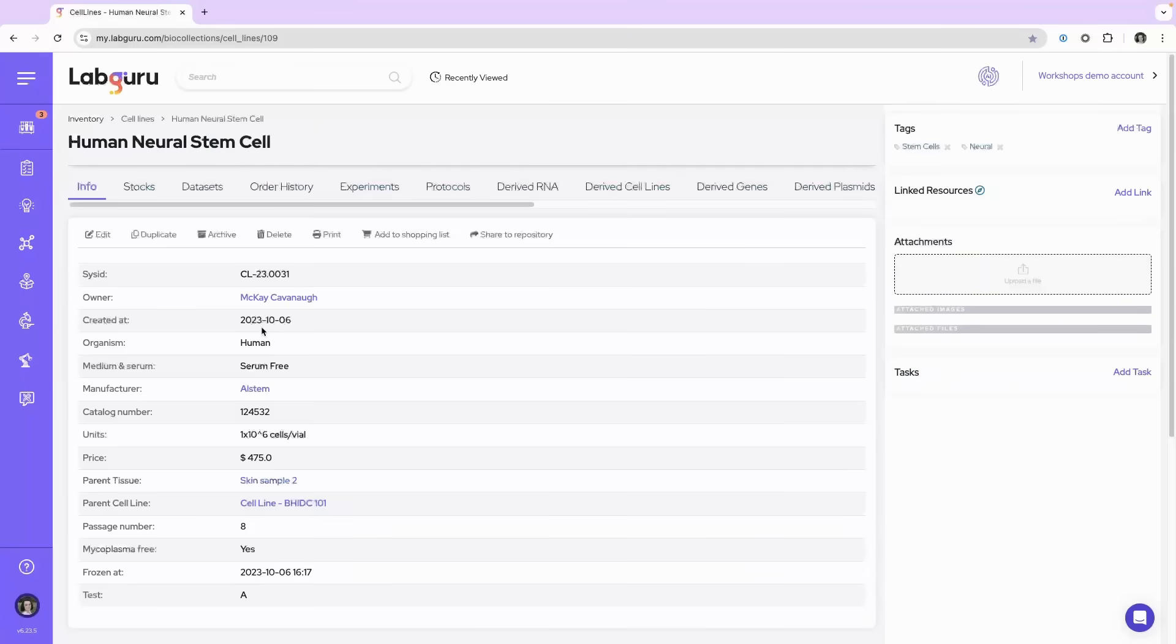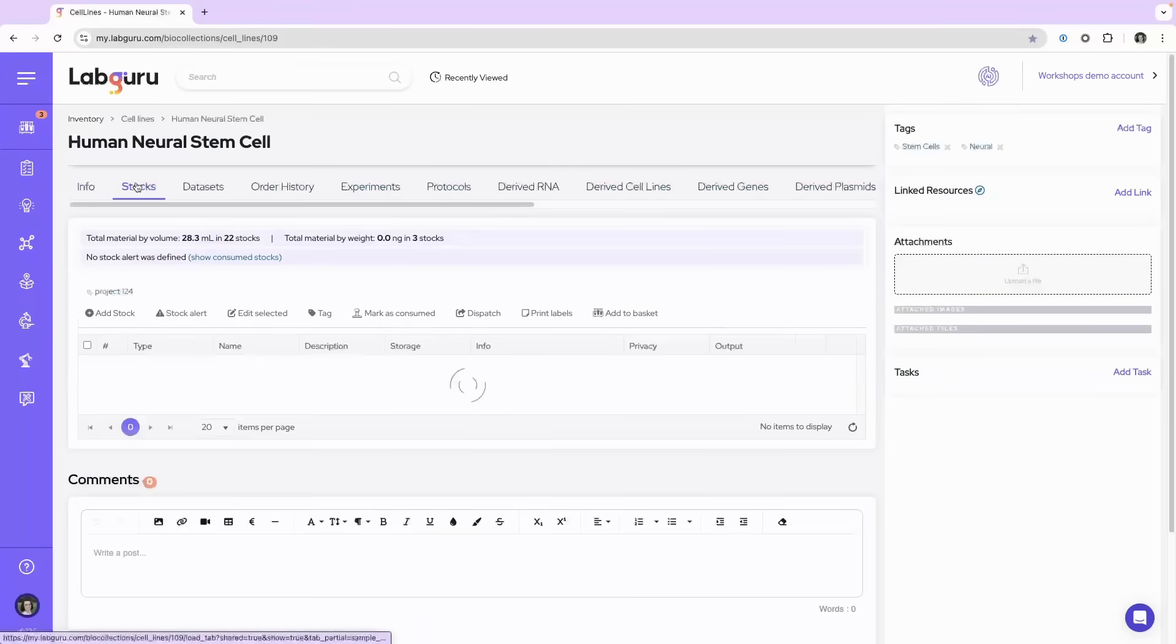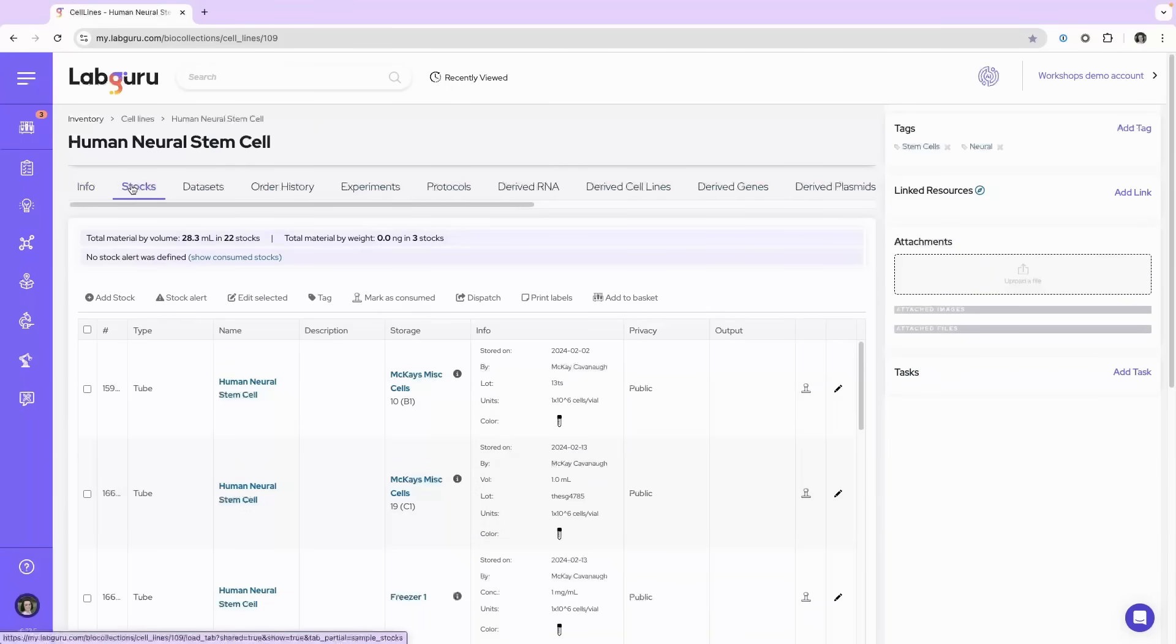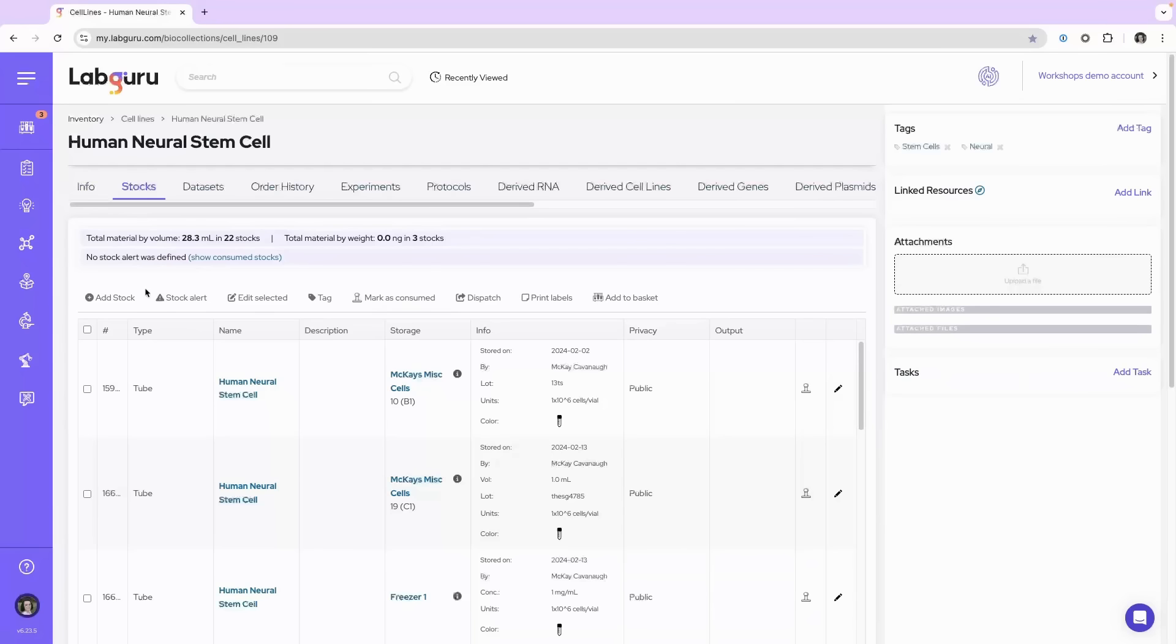Once you're at the item page, you'll click on the stocks tab and here you'll see this button for stock alert.